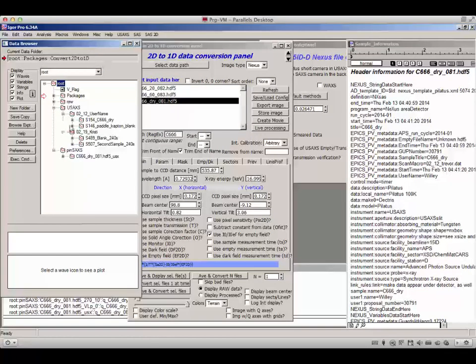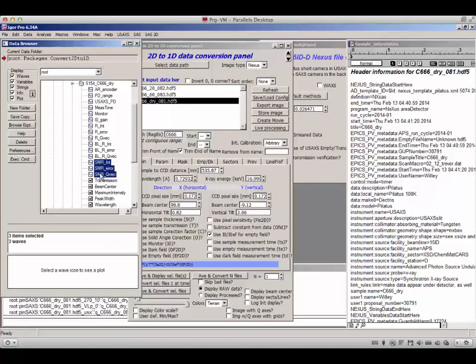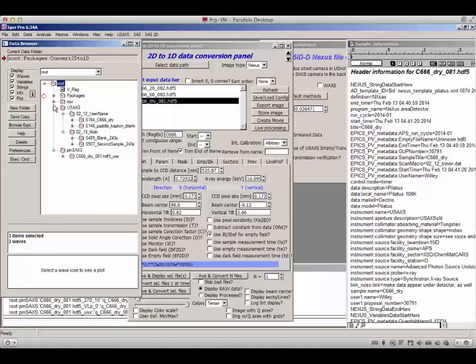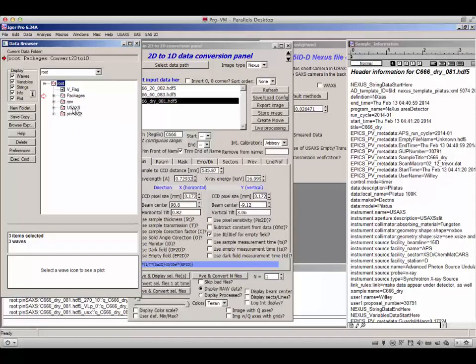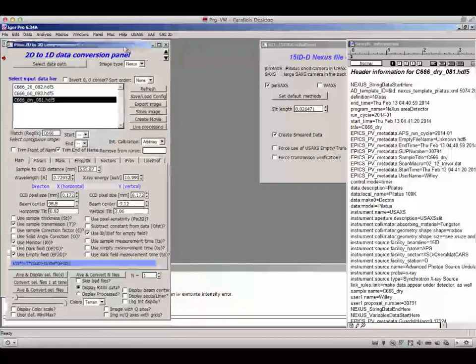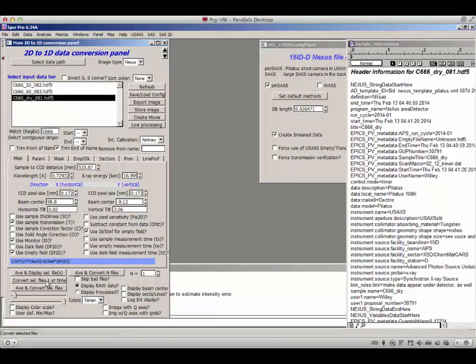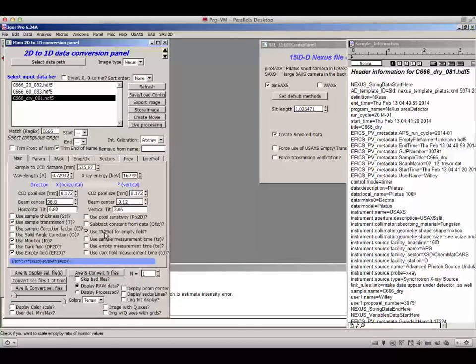The USAXS data use an SMR (slit-smeared) naming system with intensity, Q vector, and error waves. The pinhole data use a QRS naming system — Q underbar with R for intensity and S for error. You can process all images by selecting them all and hitting 'Convert Selected Images One at a Time.' The data are properly scaled using I0, empty-field subtracted (there is no dark field for the Pilatus detector), and transmission-corrected. They are not on absolute scale but are otherwise fully corrected.